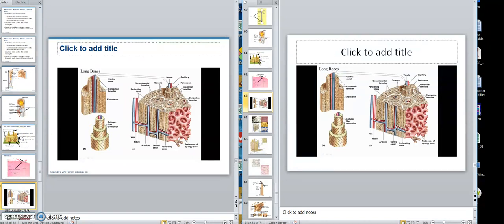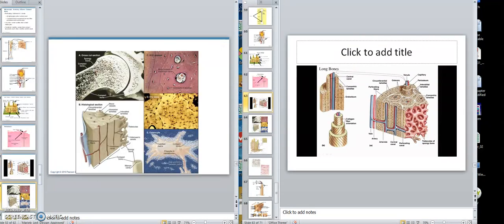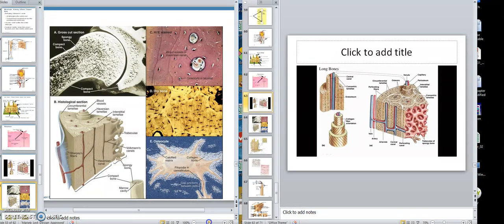Now what I want to do is shave down a thin section again. What we're talking about now is looking at these little dots right here. These particular dots that you see, which have been stained with a silver stain, they are called lacunae.